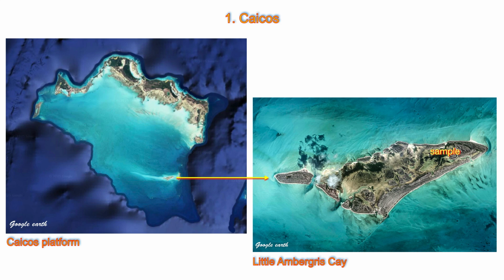Most of the samples used in this video were fragile when collected. To preserve the original fabric, they were impregnated with epoxy before the rigours of thin section preparation, and the epoxy was dyed blue to highlight the distribution of pores.